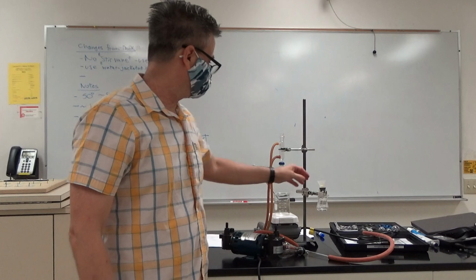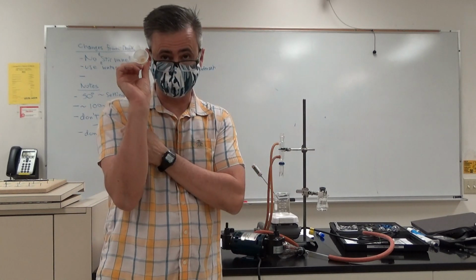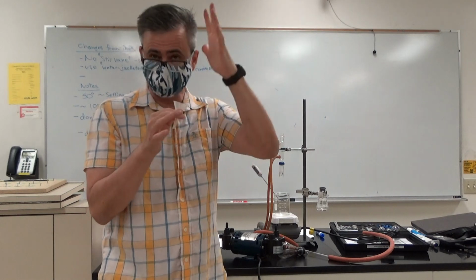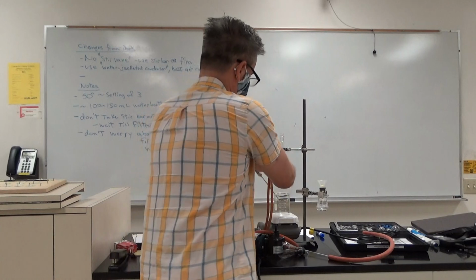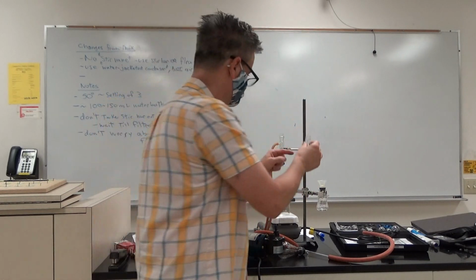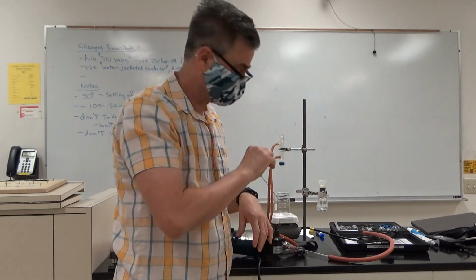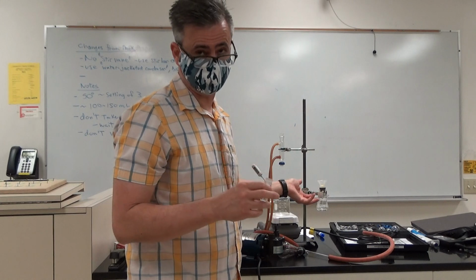Okay. And so you're going to make sure you have a piece of filter paper in here. It's white in there. Don't mistake that for paper. There's little itty bitty pieces of paper over there. You're going to put some paper on there. You're going to wet it so that it sits down nicely. Okay. And then I've got my aspirin in here. I can use a spatula here. I can use water to help it transfer. Okay. And then it sits and dries on there just like it describes in your book.